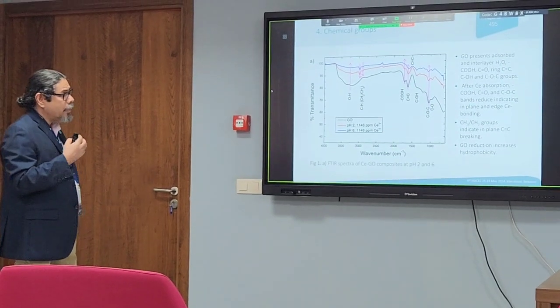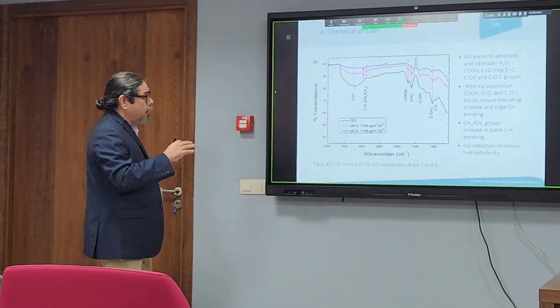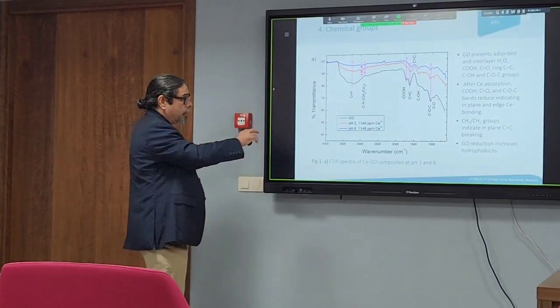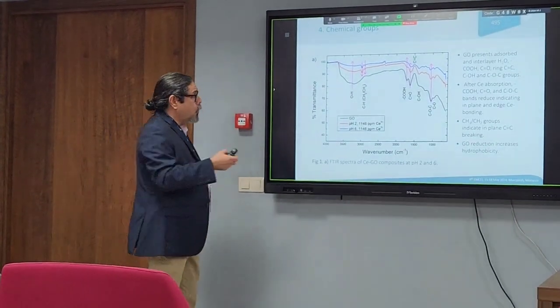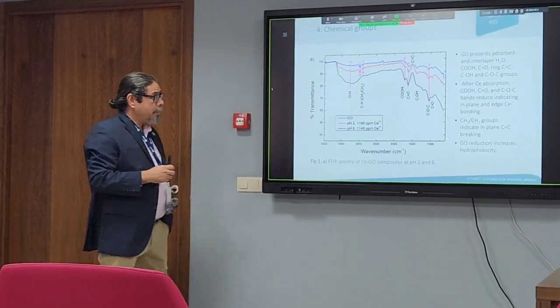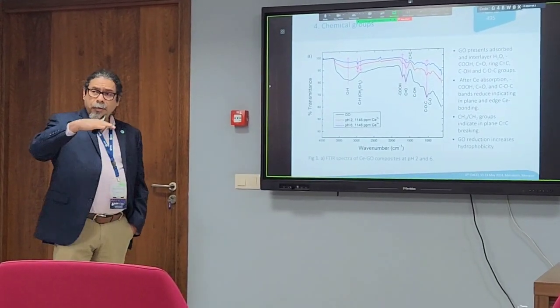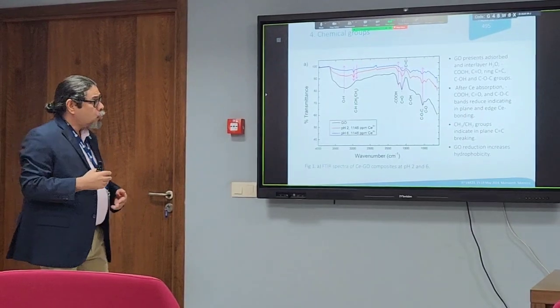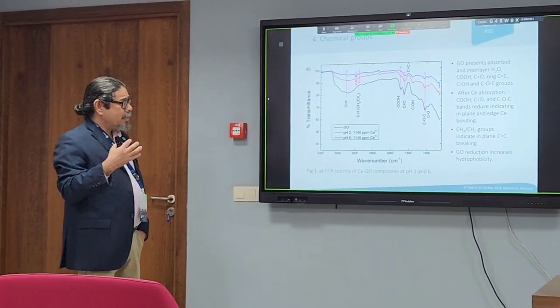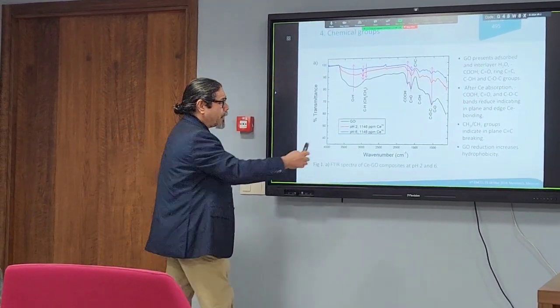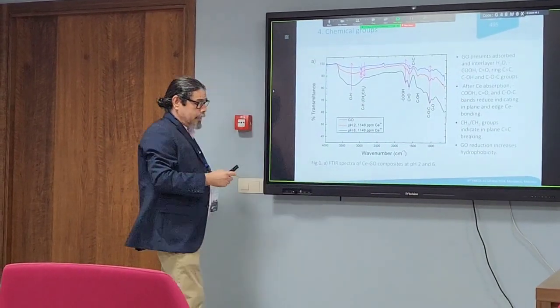In the FTIR, graphene oxide seems to absorb the cerium. It's getting reduced because we can see the formation of methylene moieties, so that indicates the graphene is breaking the double bonds. And also that cerium is getting absorbed in the carbonyl and carboxyl moieties.